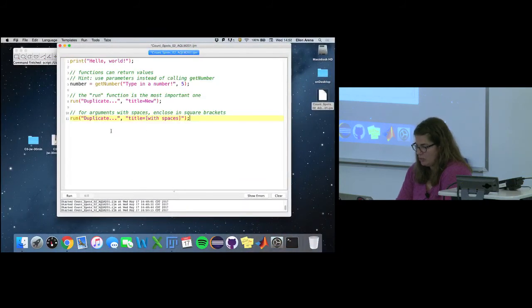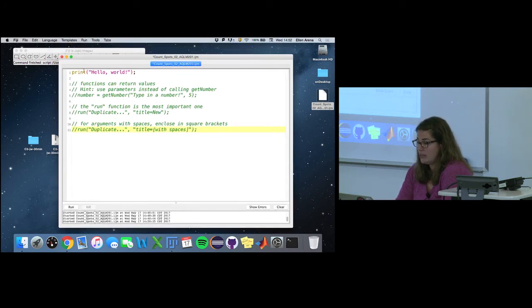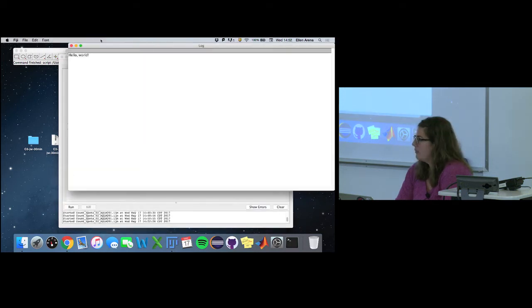And for now, we're just gonna go stepwise, right? I'm just gonna comment out those three bottom function calls. So again, our function here is in yellow syntax. The function we're calling is print, and the argument we're putting in that function is hello world. So print out that string, right? So when we run it, we print out hello world into the log window.